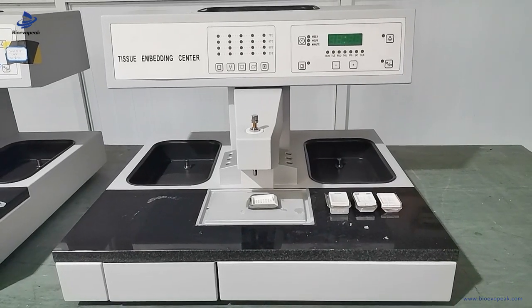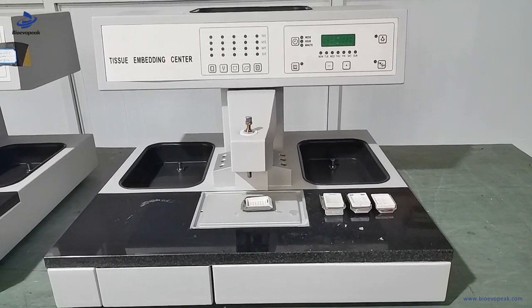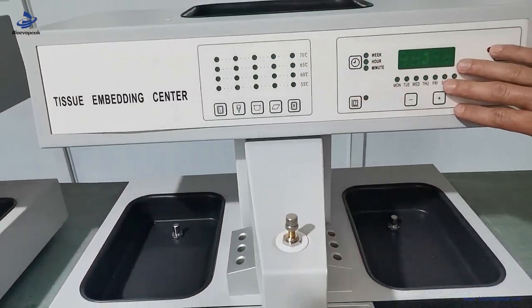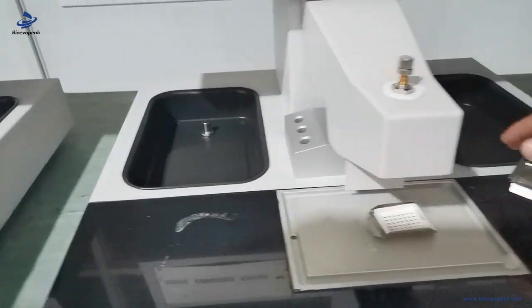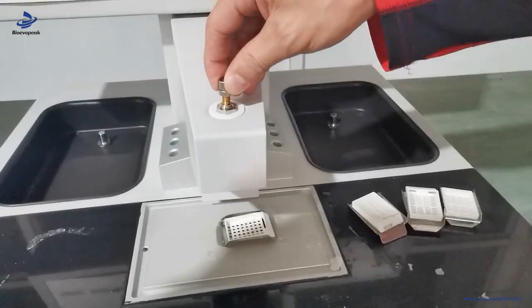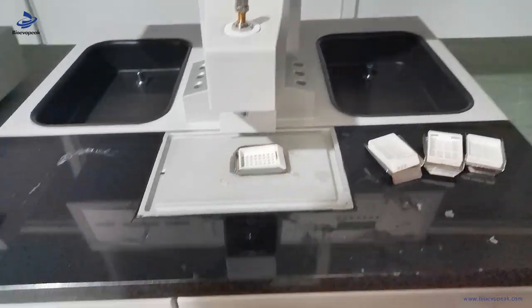Dear users, welcome to use the embedding machine. Firstly, introduction of the different parts: this is the paraffin station, control panel, left heating box, right heating box, the working table, the scoop for adjusting the paraffin flow, and the waste tray.